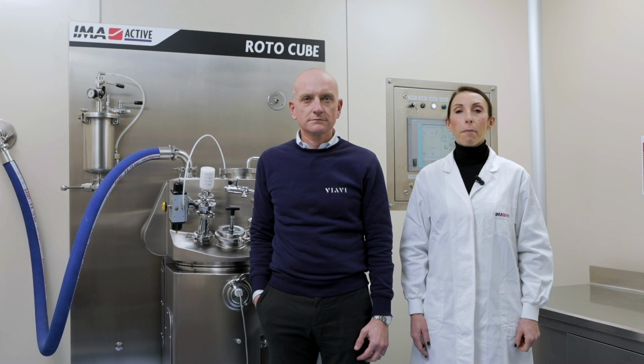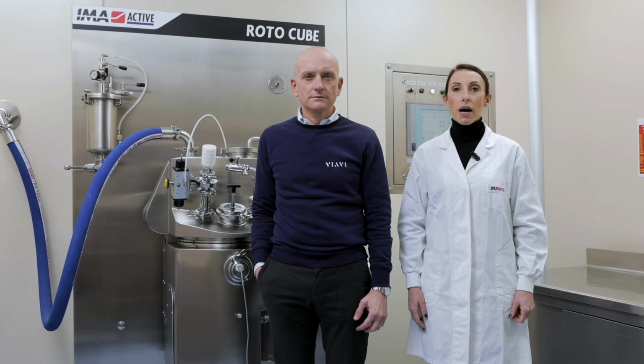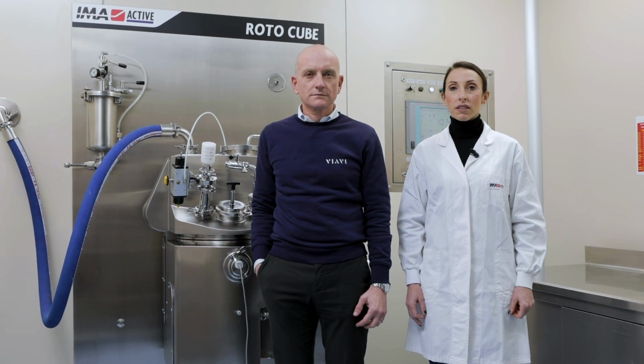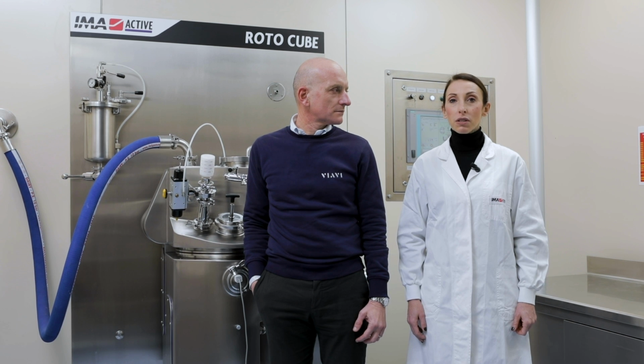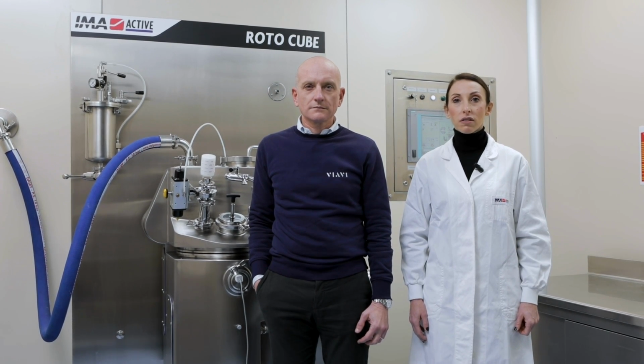The final granules properties are strictly correlated to a huge number of process parameters: bowl geometry, batch size, impeller speed, amount and method of binder addition. What is important is to find endpoints having high reproducibility by controlling all the process variables.